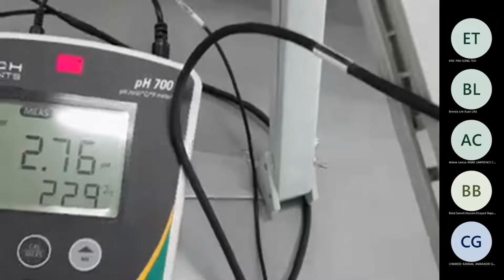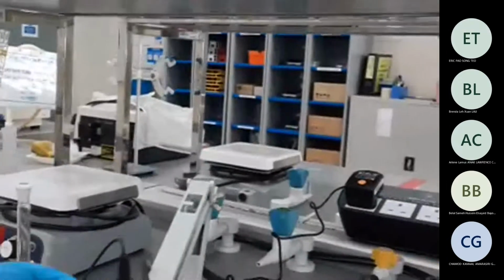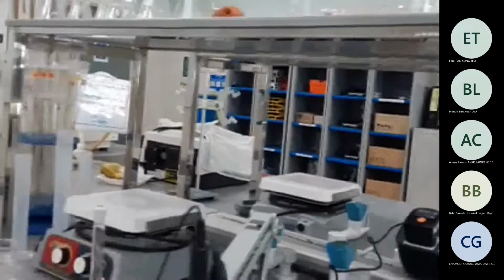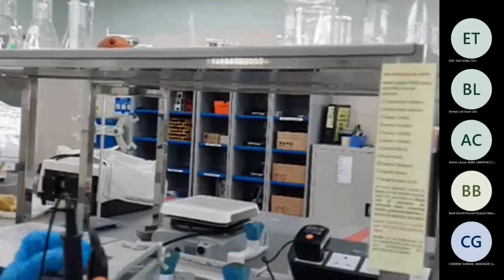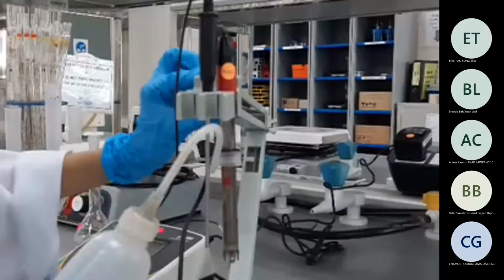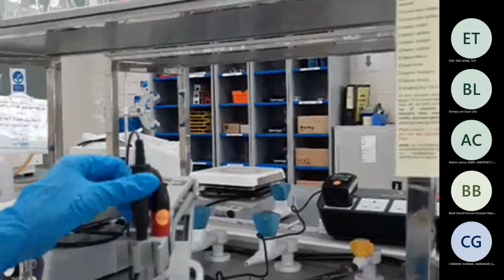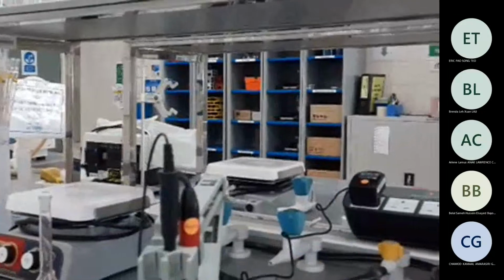All right, so this is how we have done it, and same thing, you clean it. Show me that you clean it, take it out, and then rinse it. You can just rinse in there because we are going to discard this solution anyway. Okay. Here, that one. And then wipe it a bit gently.